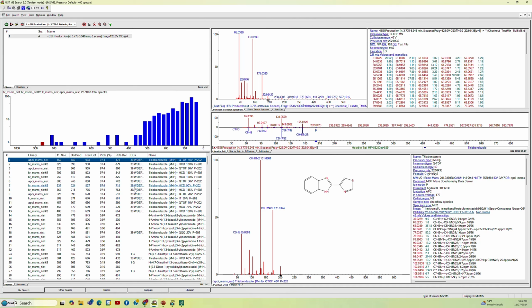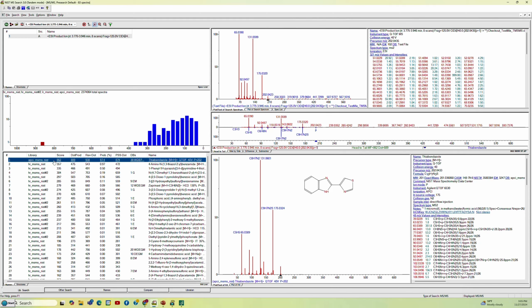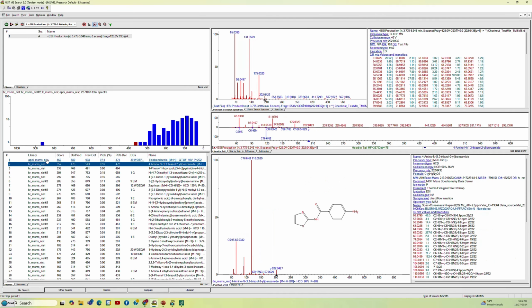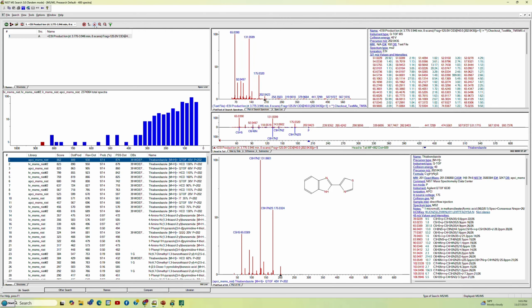The other thing is we've got so many things that are just the same. You can come up to the title bar up here and go to this best matching only. And it gets rid of all things that have the same CAS number. So that's somewhat handy. Now we're on the first one. I left clicked on the list, which is the result list for the search. And I go down, and now the second best hit is something similar, but you can see the fits drop down to 357. I really like to look at all of them initially when I'm opening the search results. So I usually leave this also off initially. So I'll click on it to get it back so I don't forget to change it in the future.